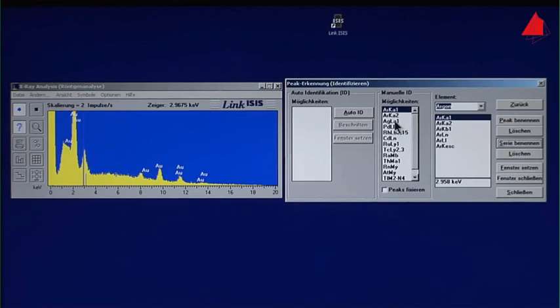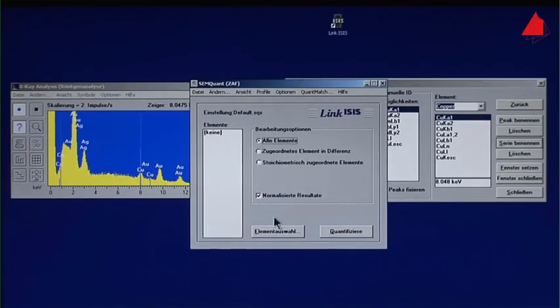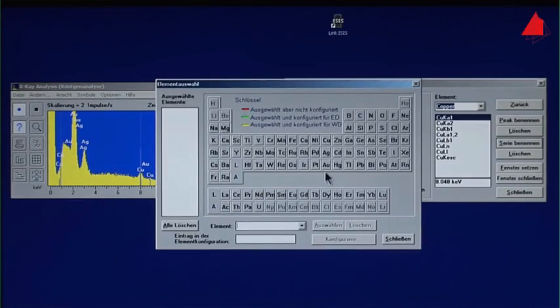Chemical analysis is then carried out using sophisticated methods with the help of a computer. Certain limitations must indeed be minded, but it's definitely a fine method, and above all, it is completely non-destructive, and even very small spots on a sample can be analyzed.